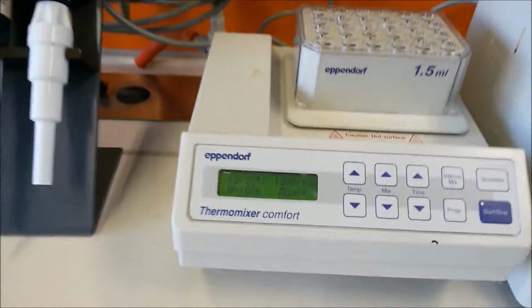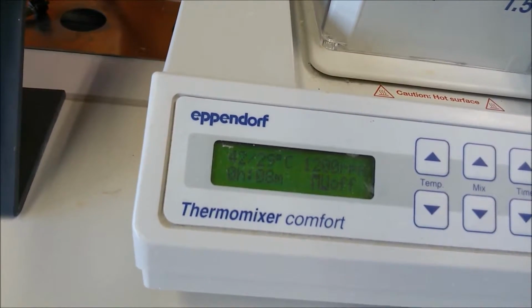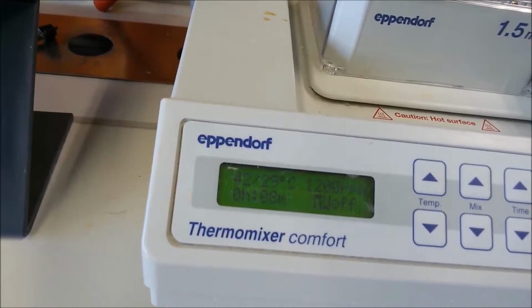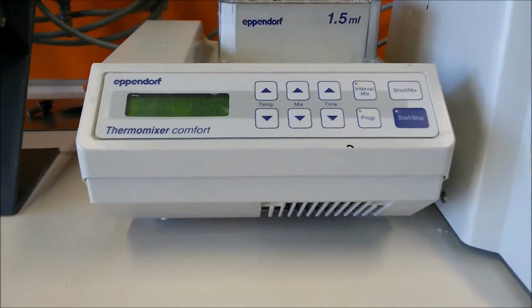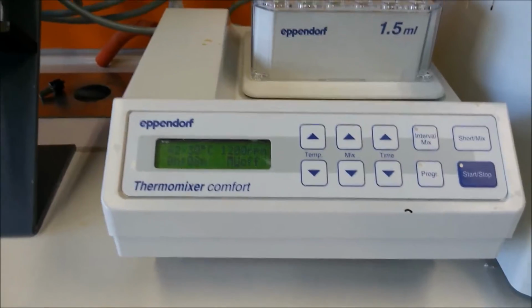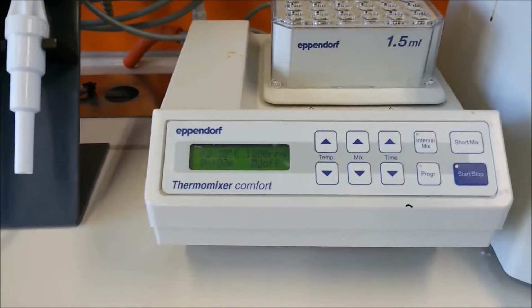You can regulate it here, and now you can see it is just getting warmer and warmer, 28, 29, and then that's how it works. So we call this nice beautiful machine Thermo Mixer. We will tell you when we use it, we will use this term, and so just keep this thing in mind.